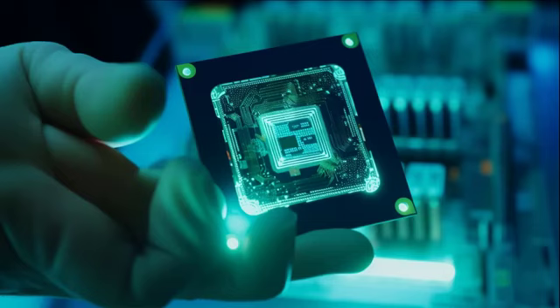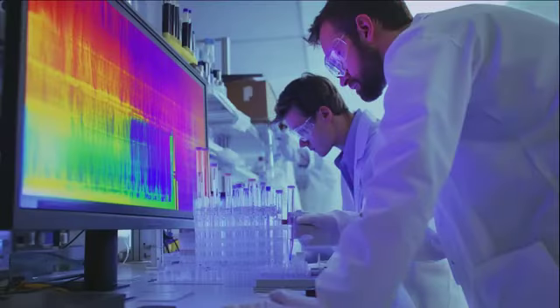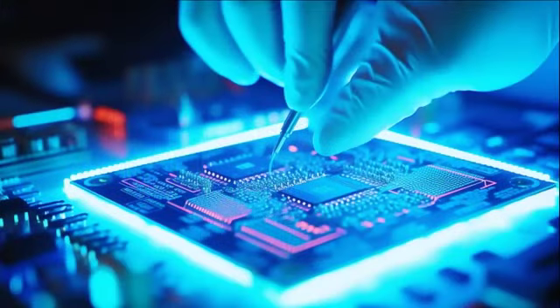3D printing is emerging as a method to fabricate lab-on-a-chip devices with complex three-dimensional architectures. For instance, a chip with intersecting microchannels can be rapidly produced using 3D printing technology, much like constructing a complex model using interlocking building blocks. Laser micromachining offers high precision in fabricating microfluidic channels on lab-on-a-chip devices, for example. A focused laser beam can ablate material from a substrate to form intricate channel patterns, much like a skilled sculptor uses a chisel to carve detailed features into stone.